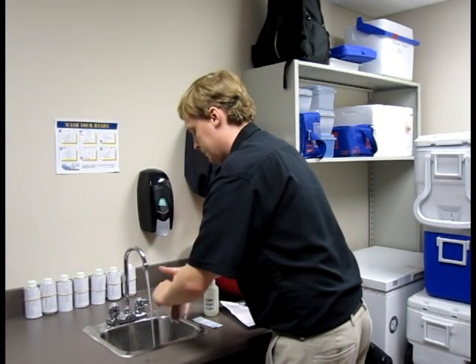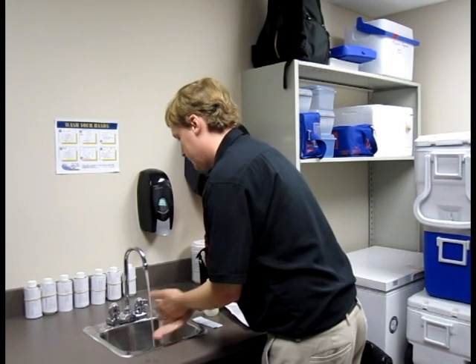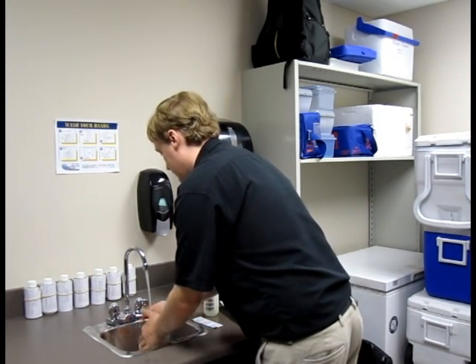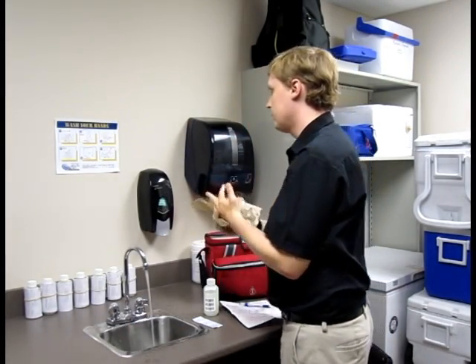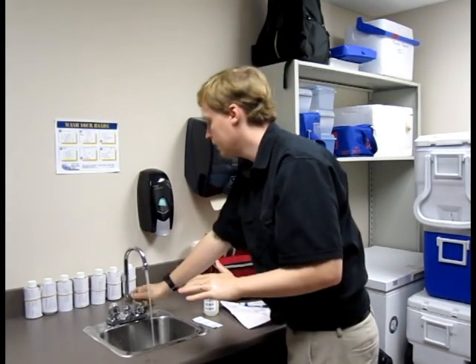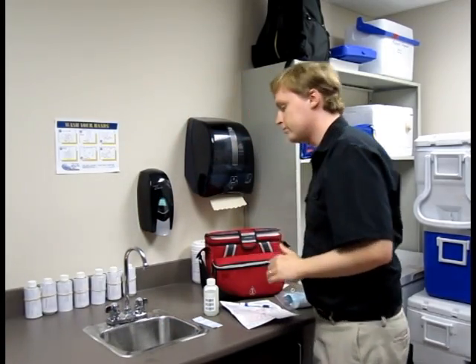The water sample should be taken at the point of use — this is usually a kitchen tap. The sample should be taken after all treatment devices such as water softeners, reverse osmosis filters, carbon filters, or UV lights, because you are trying to determine the quality of the water that you or your guests will be consuming. We recommend that you do not take the sample from a bathroom tap or an outside tap.